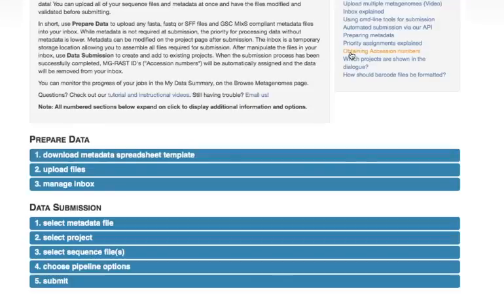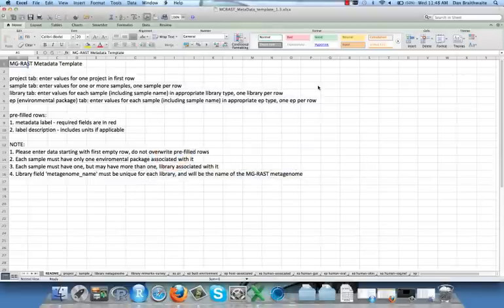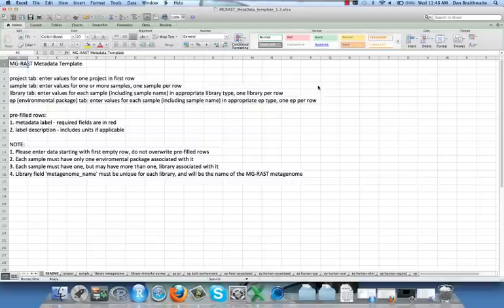Let's look at the template. It is an Excel spreadsheet containing several sheets and numerous fields on each sheet. Note that the text and cells have been enlarged and reformatted for purposes of this demonstration.